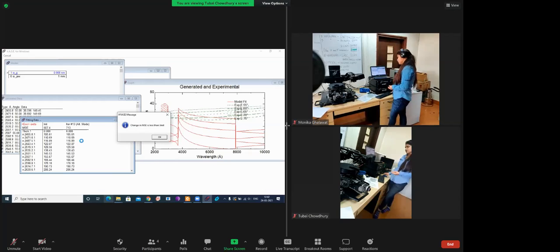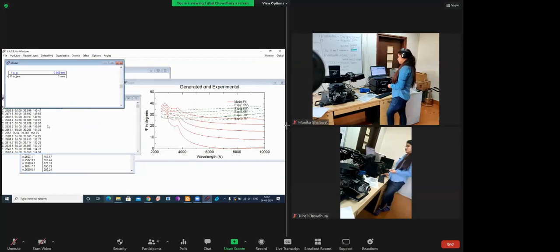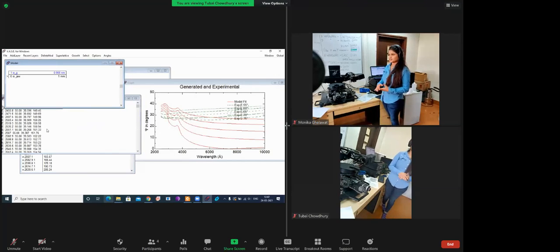Thank you for your information, but it's the right model, because whatever model we are using, we tried before this also. They are correct because they are already well known. Before me, my seniors have already worked in this field. We have just taken the model from their reference.